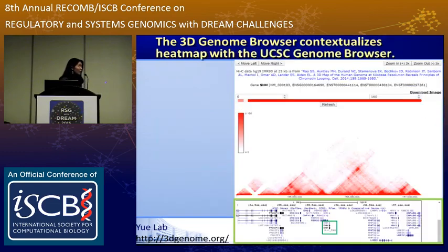Okay, so we entered our gene, and here's what we get. We see the rotated Hi-C map, which, since it's reflected diagonally, we only offer one half of to really save some space and computation power.